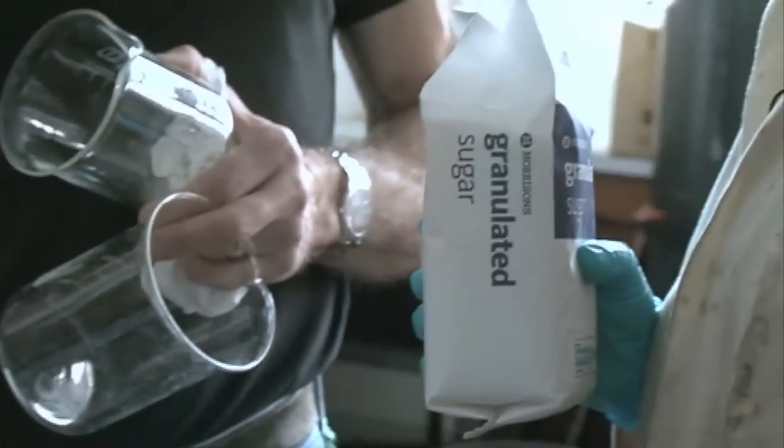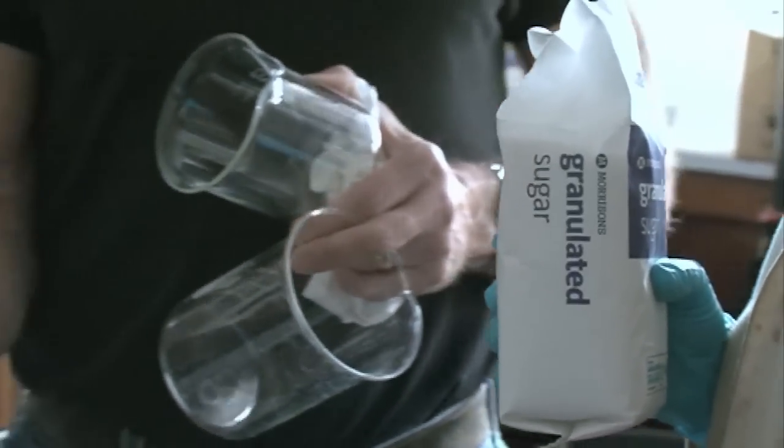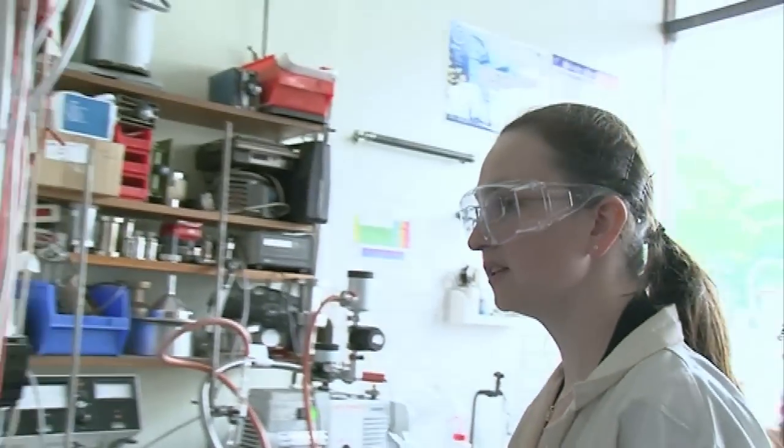So what, about 300 sugar, fill up to 500 with sulfuric? We're going to try that one. If you take a whole range of organic compounds, your body, sugars, most of these have a formula that is approximately CH2O. And if you add the acid to these materials, or you spill it on yourself, what happens is the H2O is abstracted and you're left with black carbon.